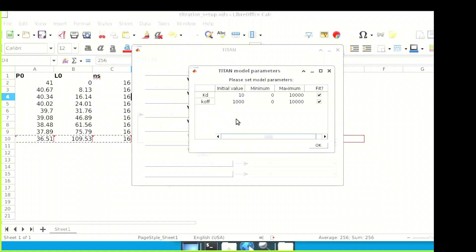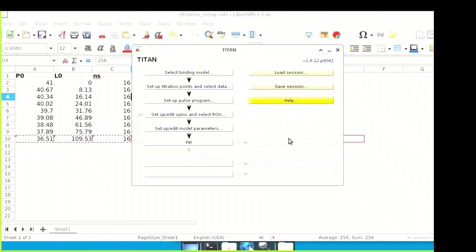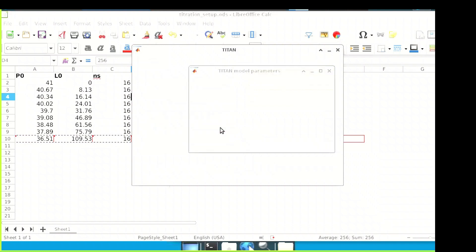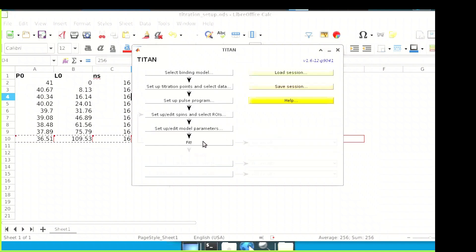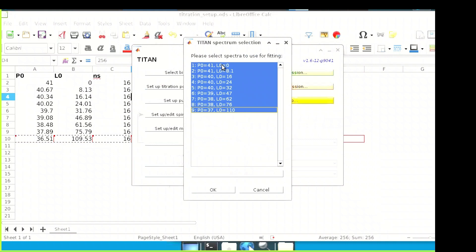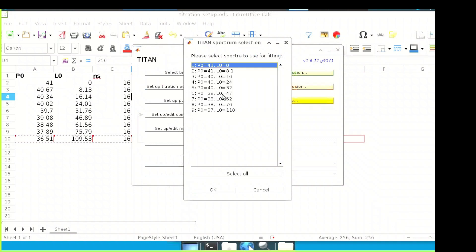The model parameters represent kinetic and thermodynamic constants such as KD and KOFF values required by the selected binding model. Although these aren't going to be fitted at this stage, we must still give them initial values, but fitting should be turned off. The fitting process will use the current setup as a starting point, but these values will be overwritten by the new fitted values, so make sure to save if you don't want to lose this data. After clicking accept, you can select which spectra to be used in the current fit — for this first step we only want to use the first spectrum.